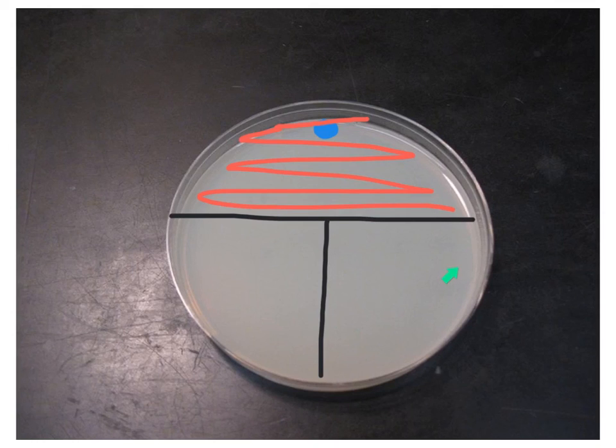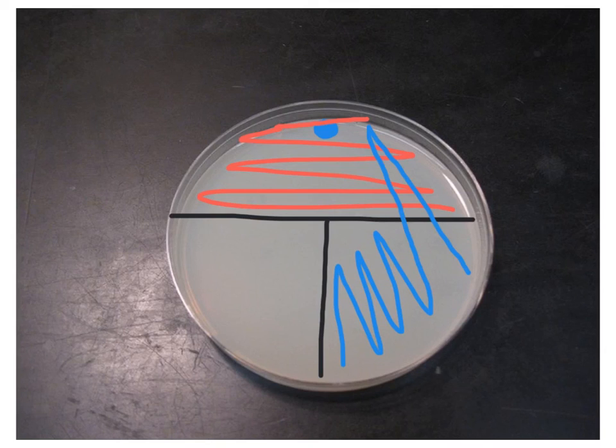I can touch this area right here and make sure there's no sizzling. If I hear a sizzling, I know that it's still hot and I need to let it cool a little bit more. I touch right here, bring it across one time, and then back and forth several times here. Then I place my lid back on my petri dish.